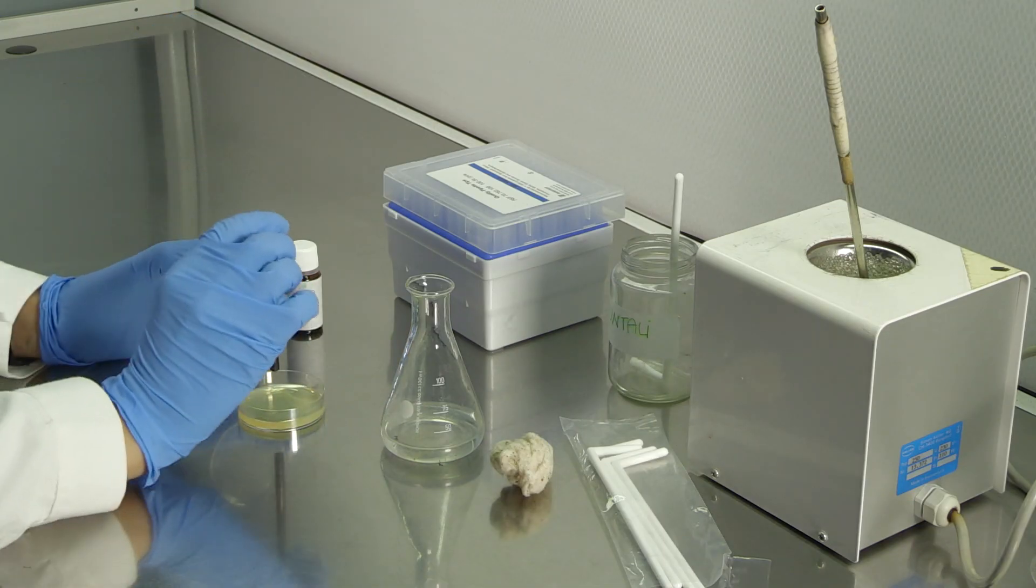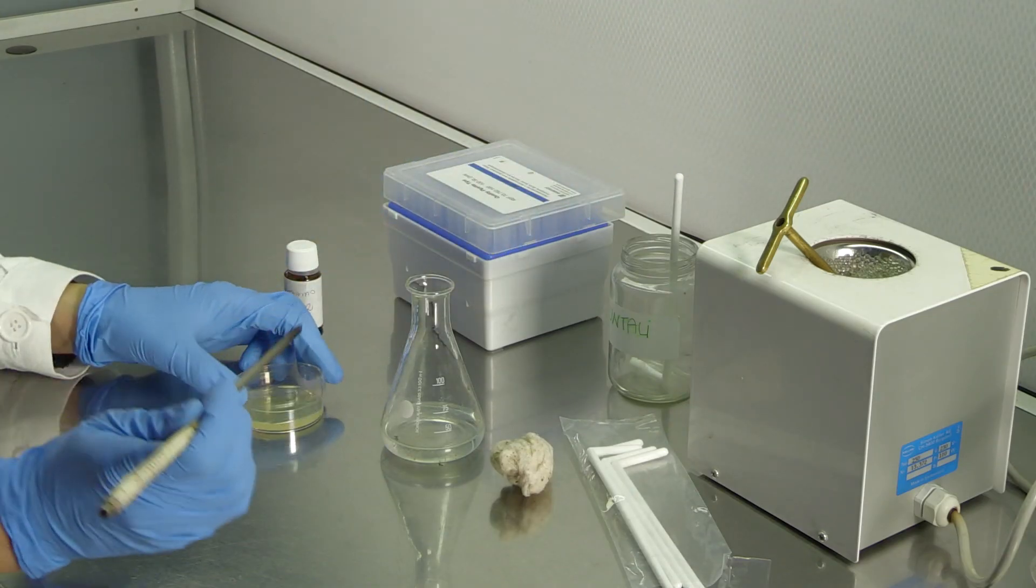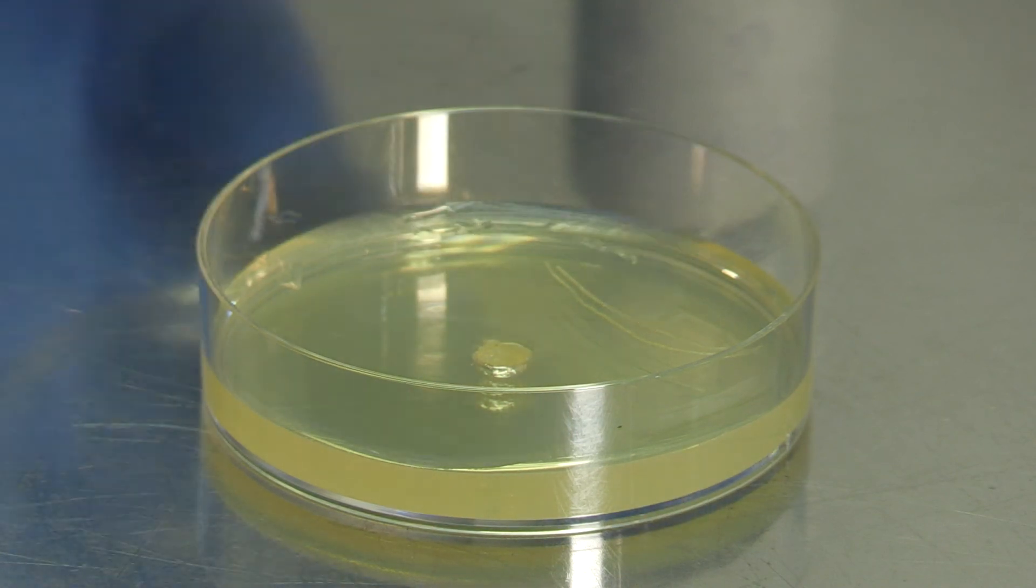With the help of a sterile cork borer, the agar surface is drilled and a small piece of agar is removed, obtaining a central well.